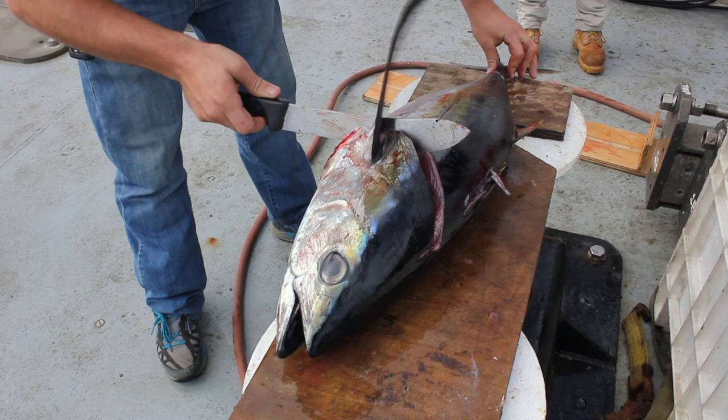This week on Voice of the Sea. You've now just entered our trace metal clean bubble. Brian's work can build an understanding of how metals are accumulated in the fish that people like to eat.